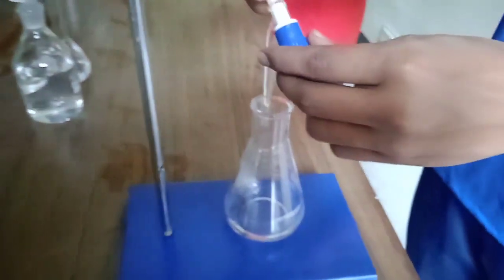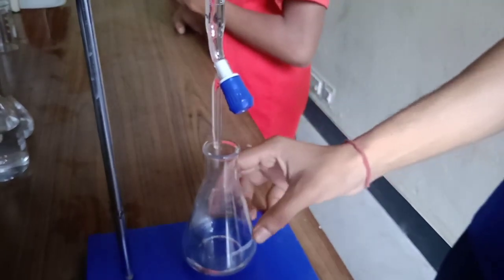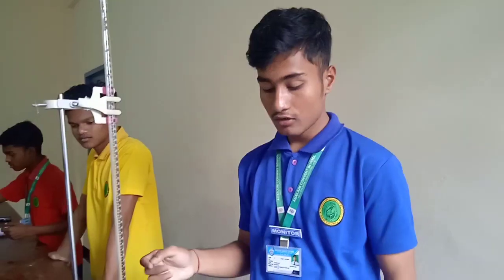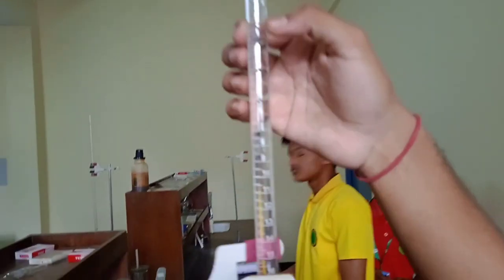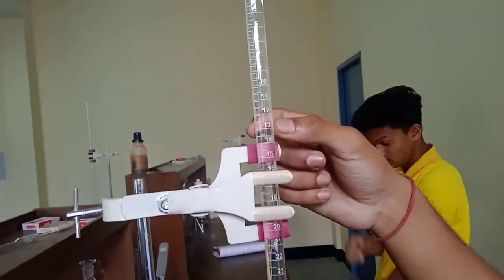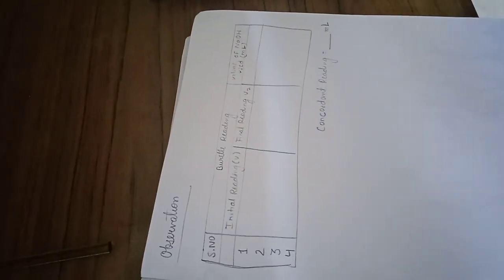So now we will simply open the tap and we will add a little amount of NaOH solution into the oxalic acid flask until the solution becomes totally pinkish. Now we will show you the initial reading — which means from where we are starting the process. The initial reading in the first trial is zero, and the final reading means the amount of solution used when the solution becomes light pink.